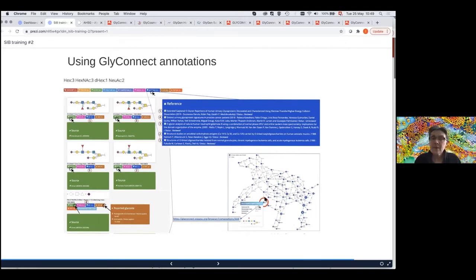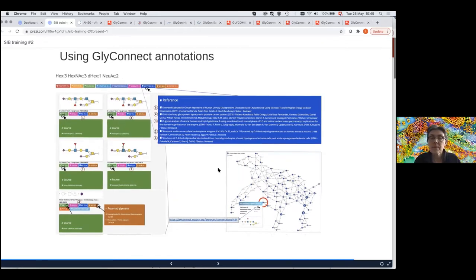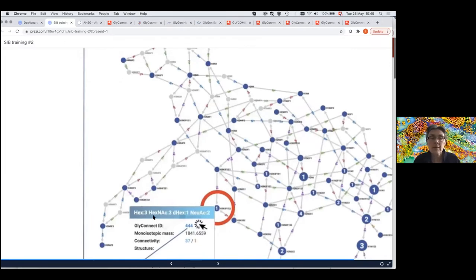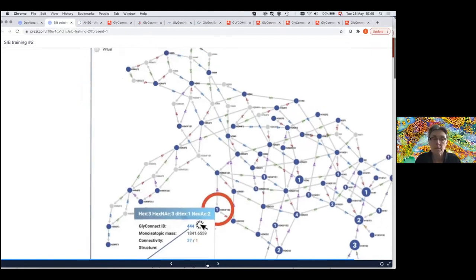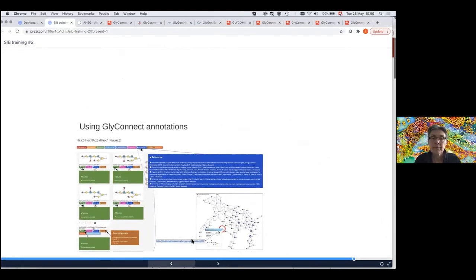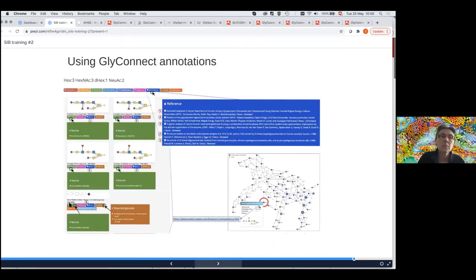This is the same network I was showing — Hex3, HexNAc3 and so on. In GlyConnect Compositor, each node has a tooltip and you can click on it to get to the composition page. If you click on this composition, you have a GlyConnect page that opens and you can use the annotation.